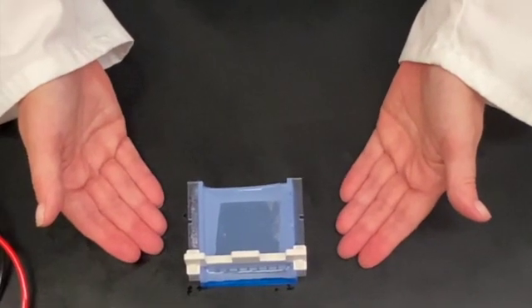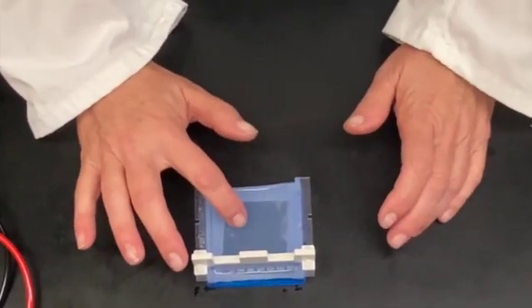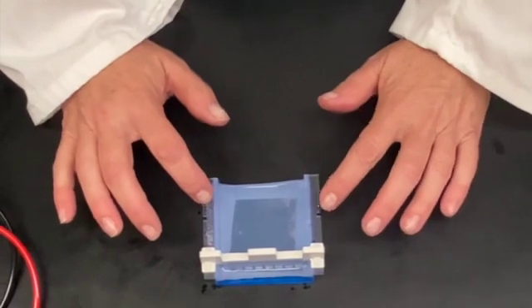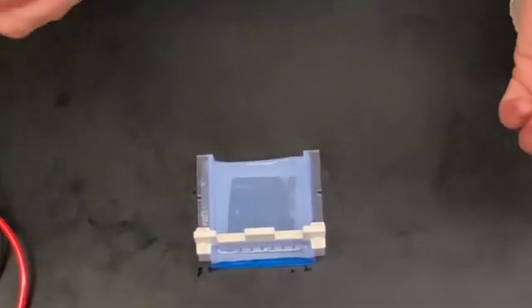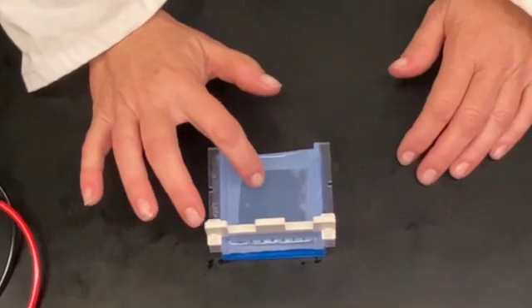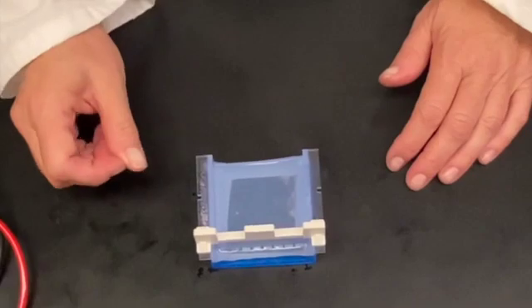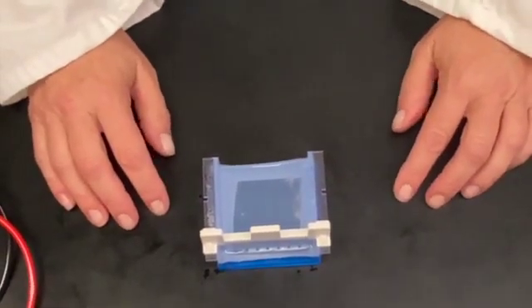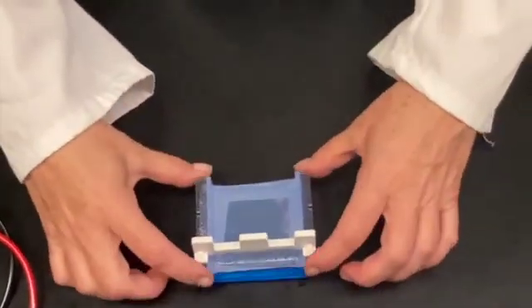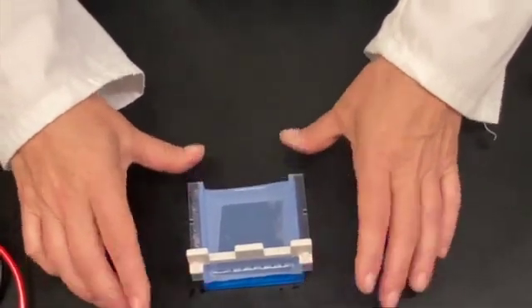This is a gel and what you see in here is actually the gel. It was poured into this gel form when the gel was liquid, kind of like how you make jello — you make the jello, it's liquid, and then you pour it into a bowl and it solidifies. It's solid right now but it was poured into this gel form at one point by a lab tech, and in order for the gel to stay in place they had to put tape around the edges.